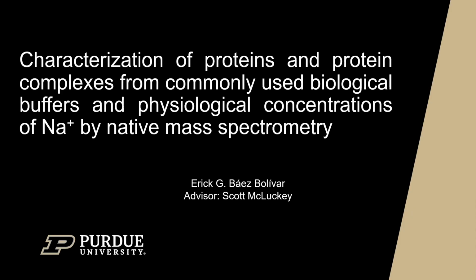My PhD research and interest can be summarized with the following title: Characterization of proteins and protein complexes from commonly used biological buffers and physiological concentration of sodium ions by native mass spectrometry. But this really involves other metal ions at physiological levels, of course.